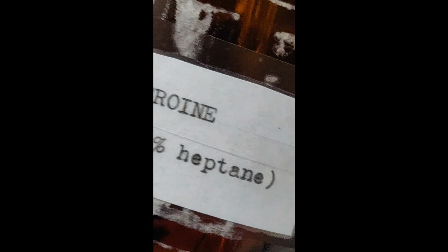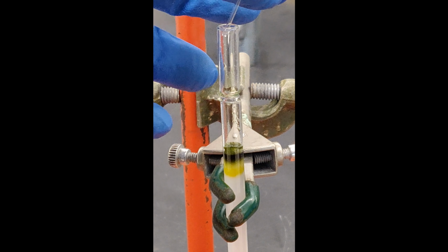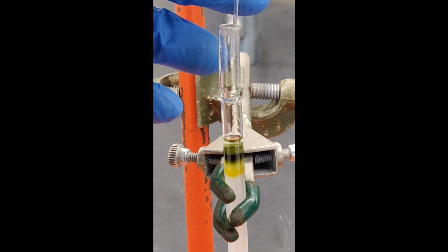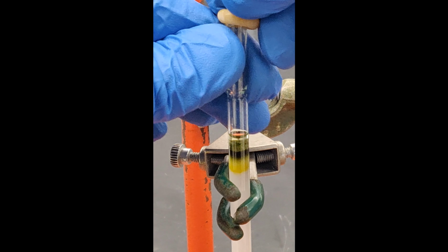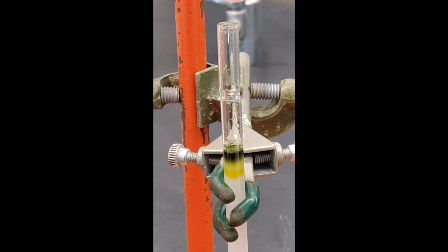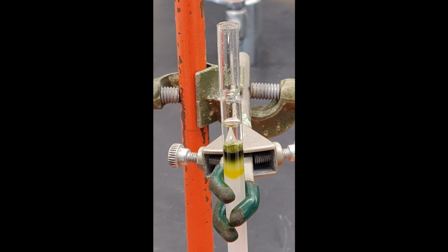Then, wash down any pigments on the inner surface of the column with small amounts of Ligroin. Repeat this several times more, each time letting the solvent go just below the level of the sand before adding the next portion of Ligroin. In this way, you ensure all pigments will be stuck to the surface of the silica before you fill the column with eluent. Even at this point, you can begin to see some yellow pigment separating away down the column from green pigment.